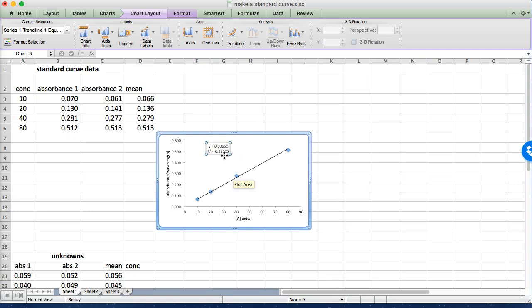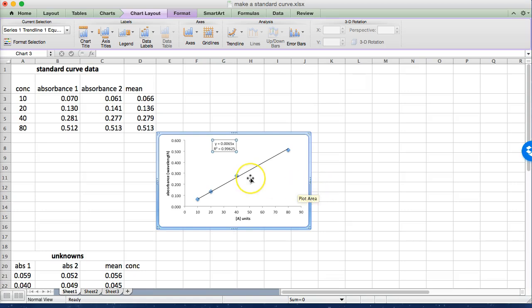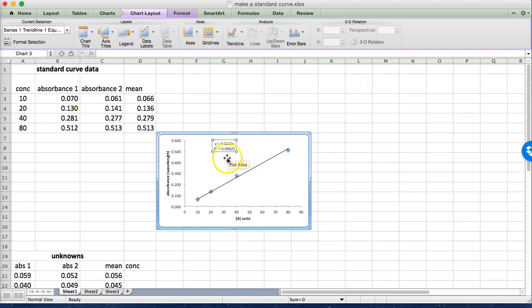This might be a little small in the video but my r-squared value is 0.99625 so a perfect fit would be one. You wouldn't expect to get one very often because that just doesn't happen. Anything for this type of a standard curve you would expect at least 0.98 for an r-squared value because you've controlled the concentrations you should get pretty consistent measurements. And then we have our equation y equals 0.0065x which we're going to use to calculate the concentrations of our unknowns.